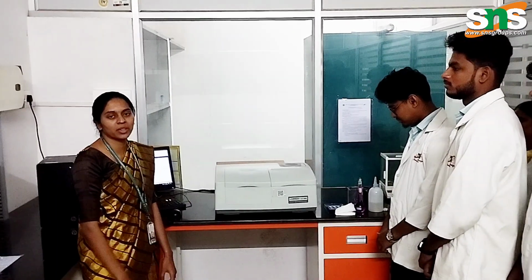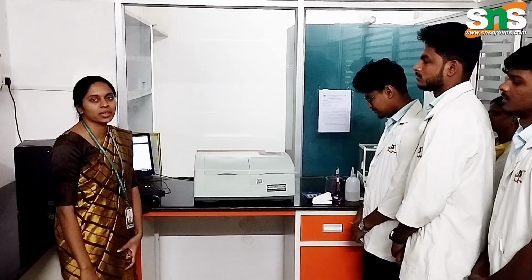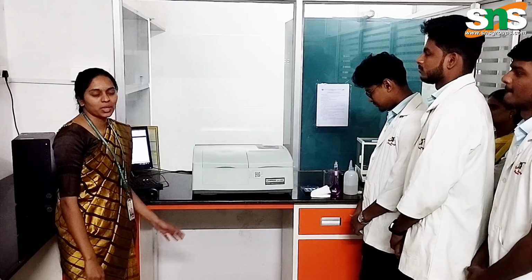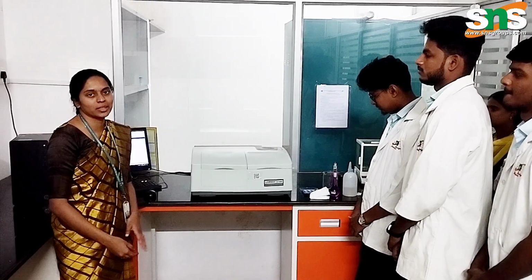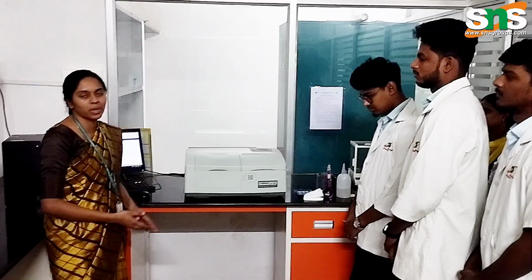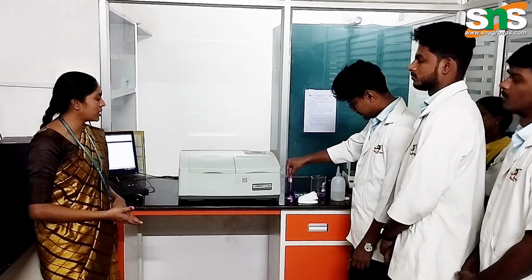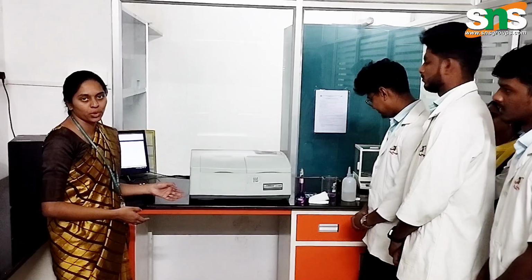In this lecture we are going to determine the lambda max of a given sample. The given sample is potassium permanganate. Potassium permanganate is an oxidizing agent and its color is purple. We are going to determine its lambda max with the help of a UV Visible Spectrophotometer.